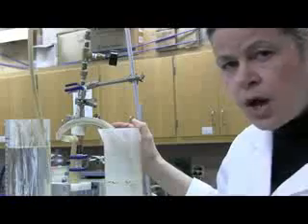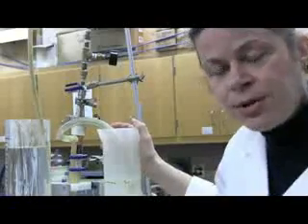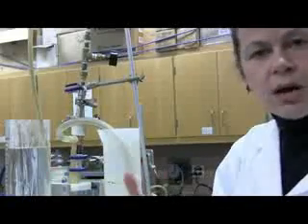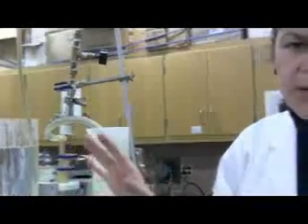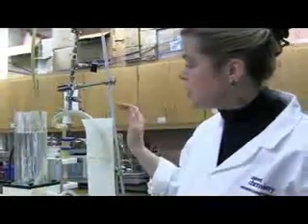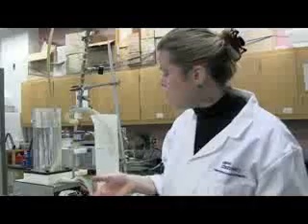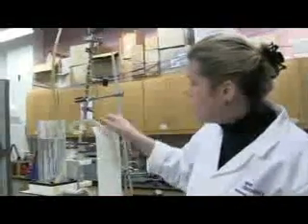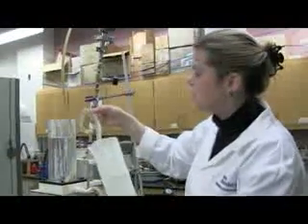So you buy the milk, I'll buy the milk, you read the label, and it's going to say how much protein there is in milligrams per serving or whatever it is. So you have to convert that into milligrams per liter, and then you're going to use the total protein method that I've instructed you to use with the UV-visible spectrophotometer, and we are going to measure the protein content of the permeate.